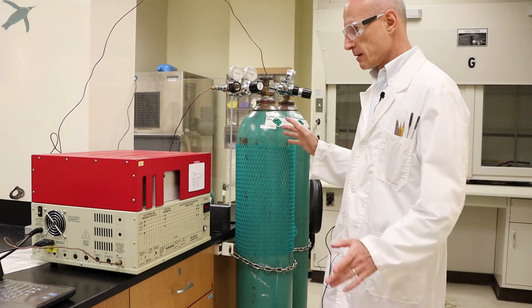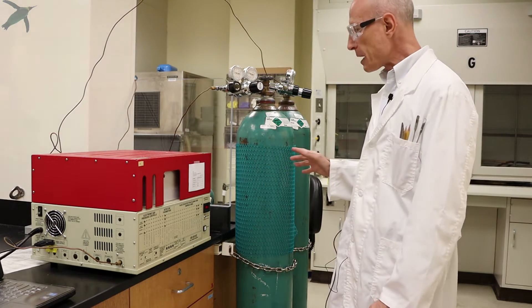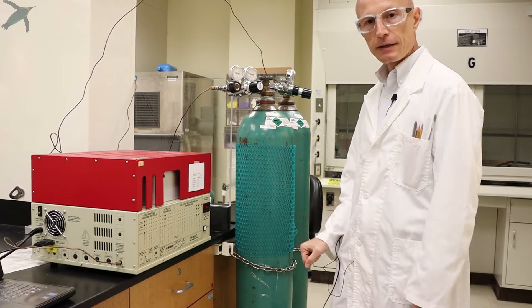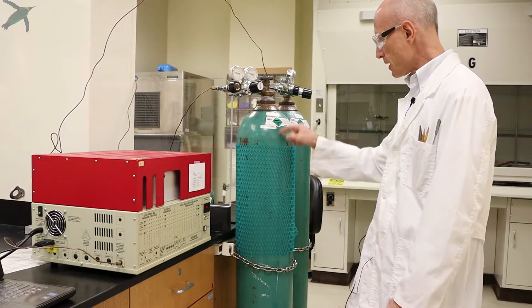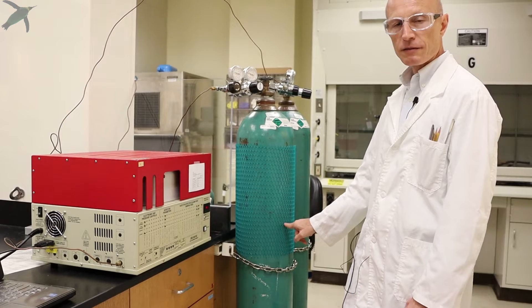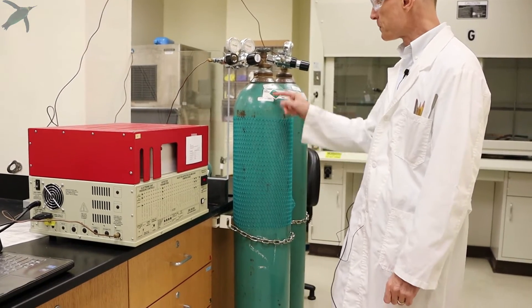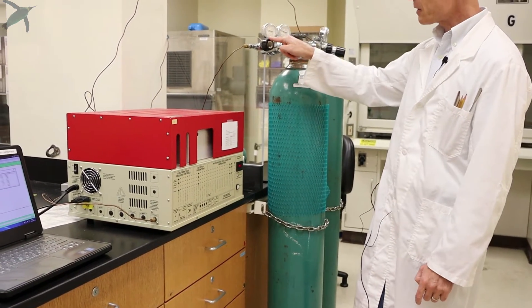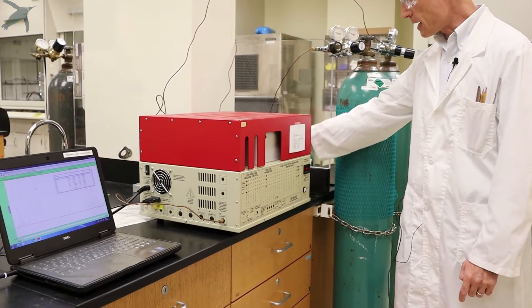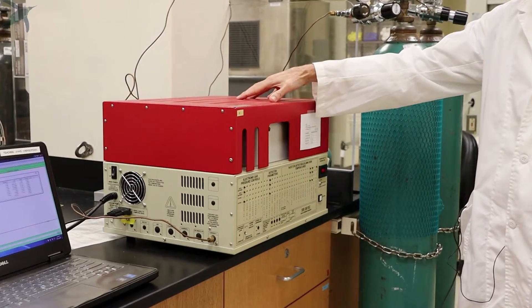So a classical gas chromatography setup is like this. As you can see, you have a carrier gas reservoir, normally helium, you have a pressure regulator, and a gas line that goes into the gas chromatograph.